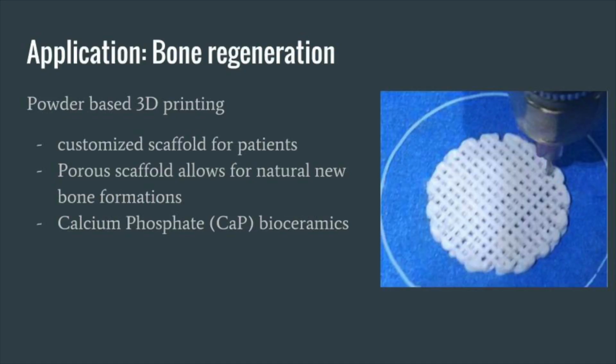However, current researchers have found some challenges with depowdering the scaffold. Depowdering is the technique where the powder that is not adhered to the actual scaffold is blow dried. Since the scaffold is very fragile, blow drying can sometimes damage it, and then it won't be implanted as effectively into the patient.